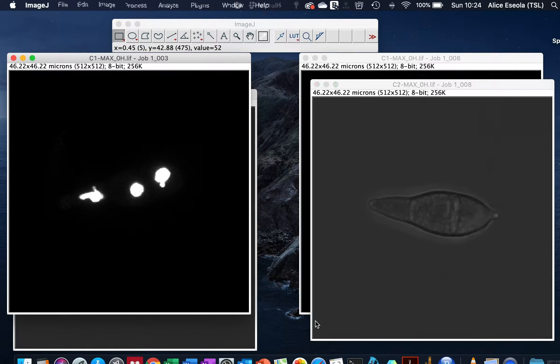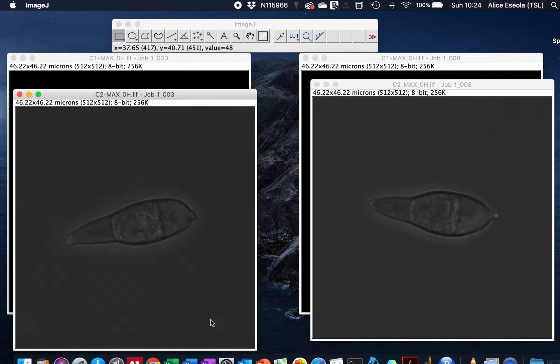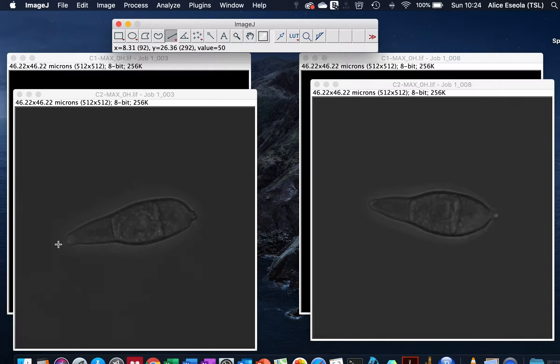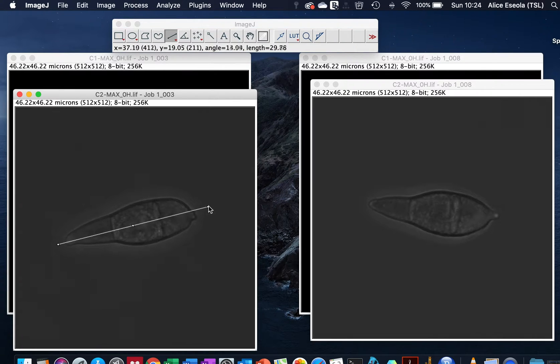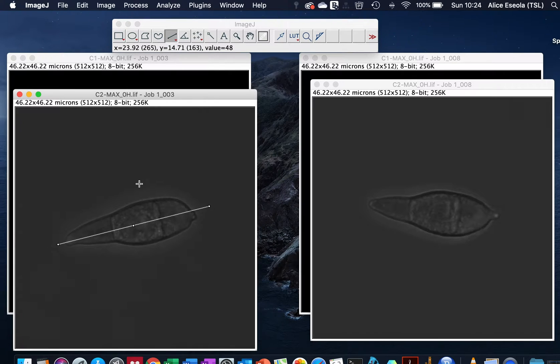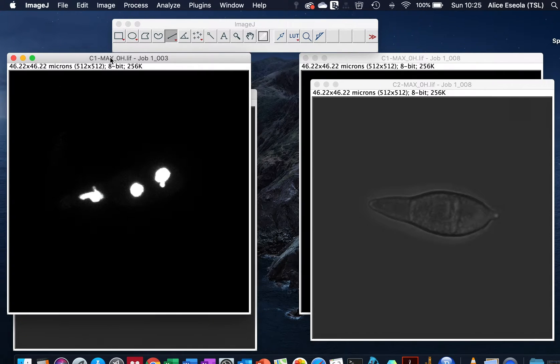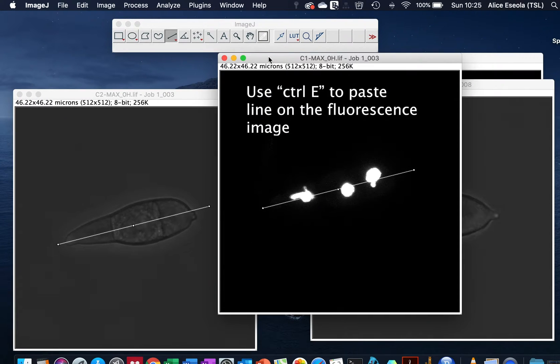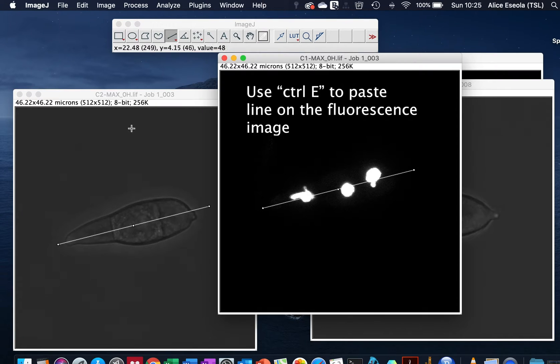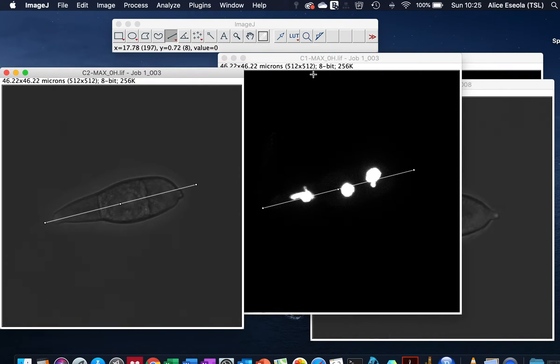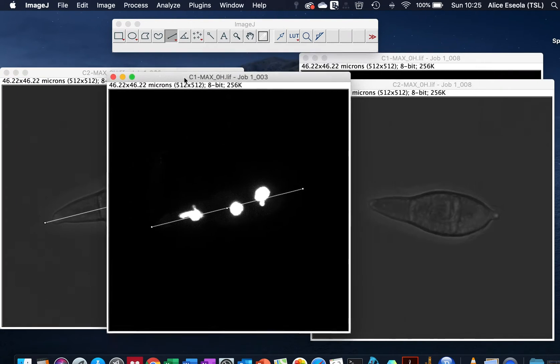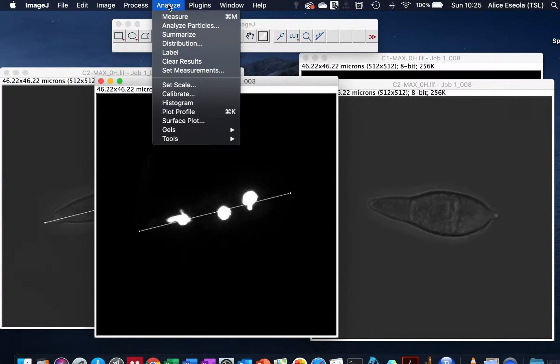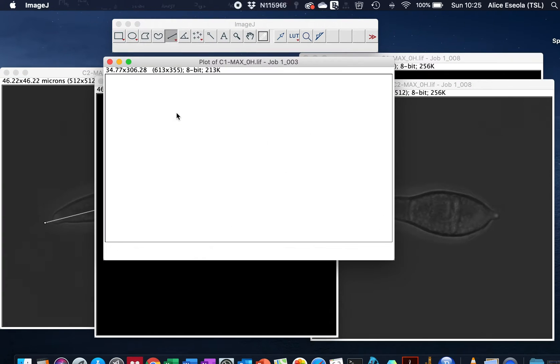Next we'll draw a line across our sample. We can place this straight line on our fluorescence sample. Clicking on Control E to paste this line that we drew on the bright field onto the fluorescence channel. To plot a line graph we go to Analyze, Plot Profile.